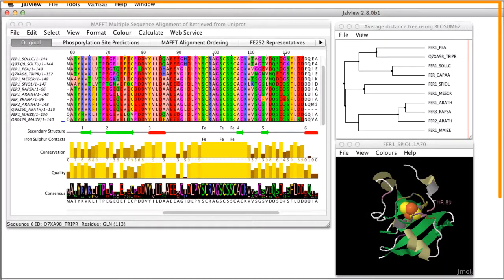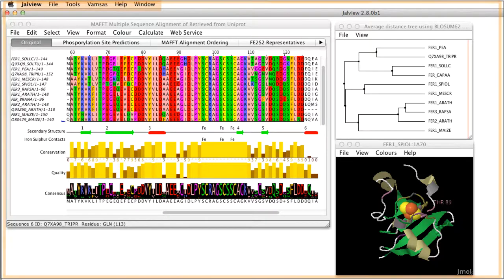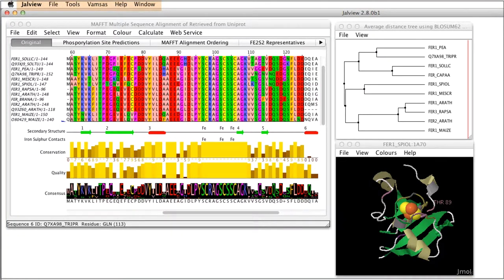Basically everything sits within the desktop window. The desktop window has drop-down menus including file, tool and help.